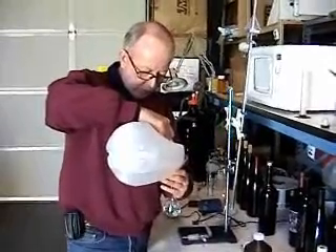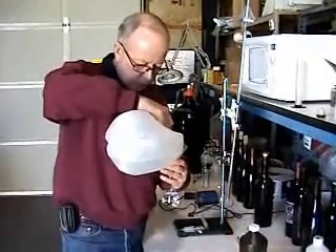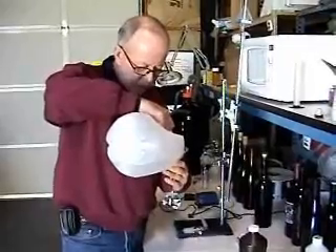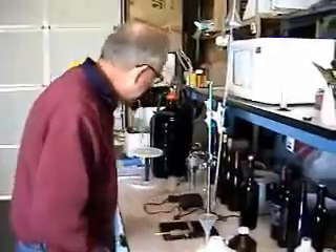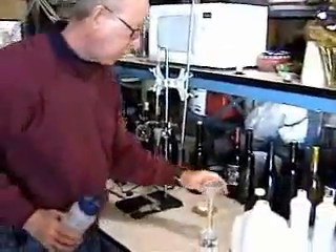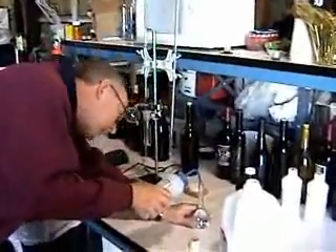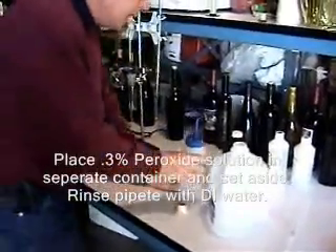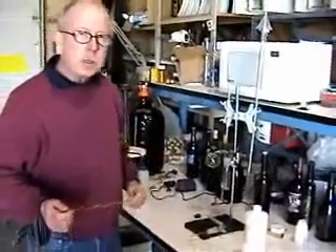Here's where you have to be a little bit careful. What I do is take it up to just where the neck starts on the flask, and then very carefully take it up to the exact volume that you want.